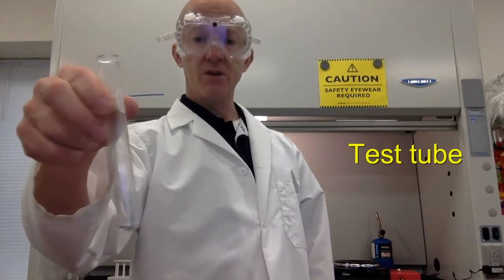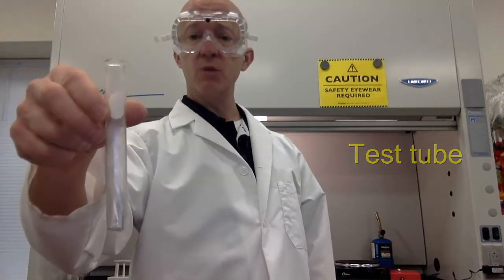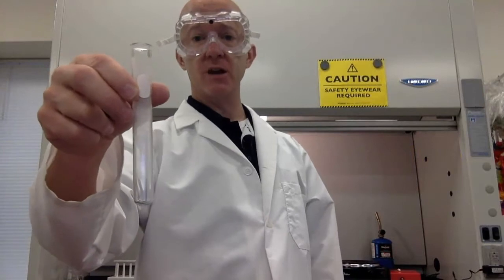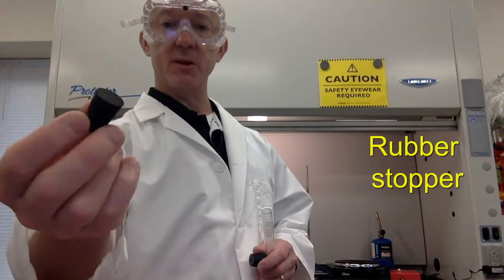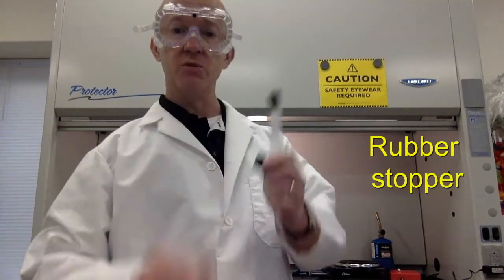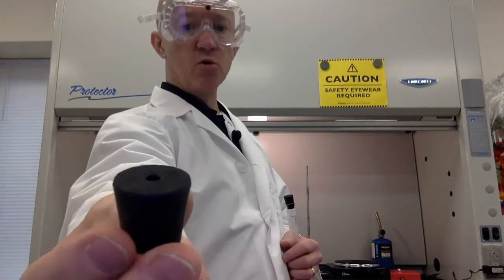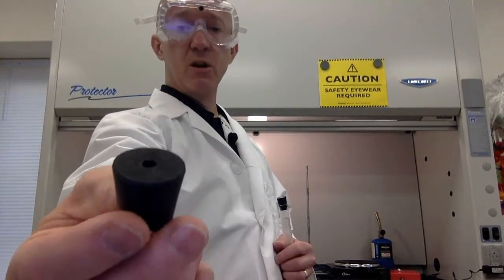Here's another one you've probably seen before, the test tube. Pretty self-explanatory. We use these when we have smaller amounts of chemicals to mix together. You might run across one of these from time to time. These are rubber stoppers. Pretty self-explanatory. You can use them for test tubes, or for Erlenmeyer flasks, whatever. Some stoppers have holes in them so that you can use them for things like putting a thermometer through.